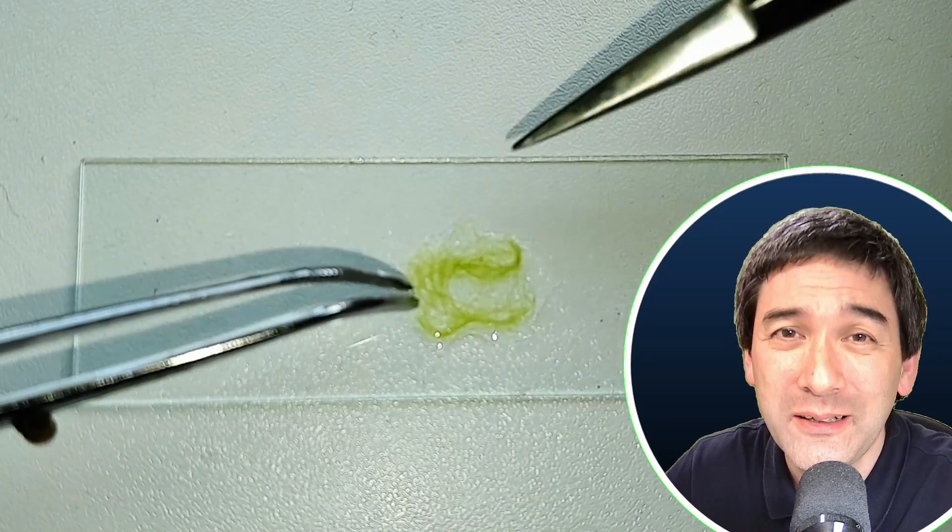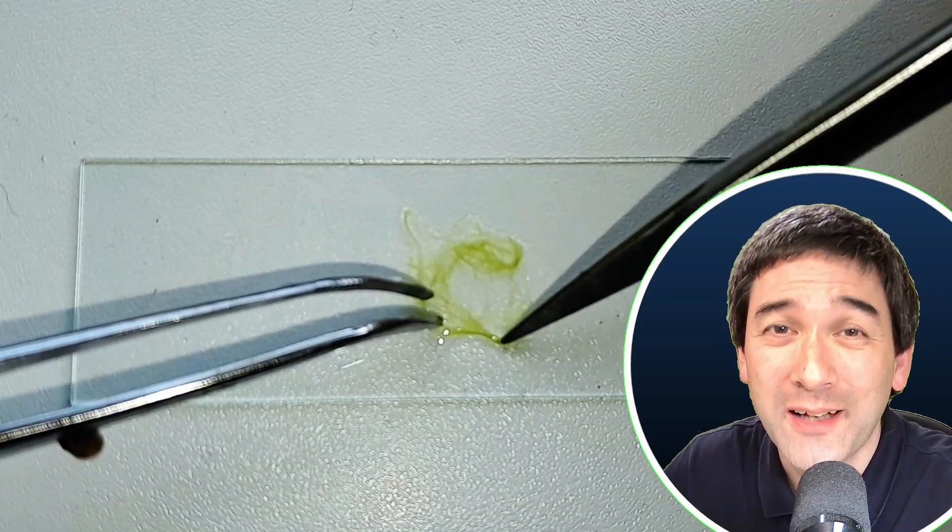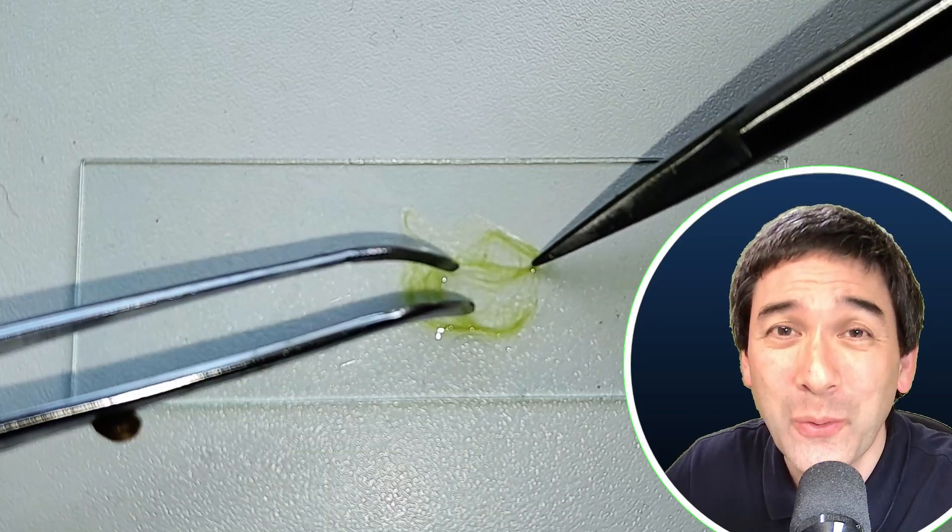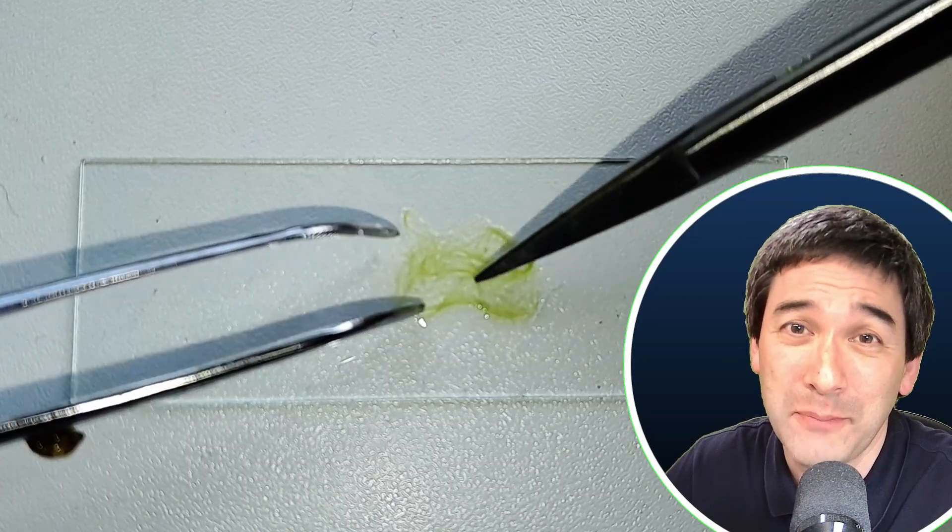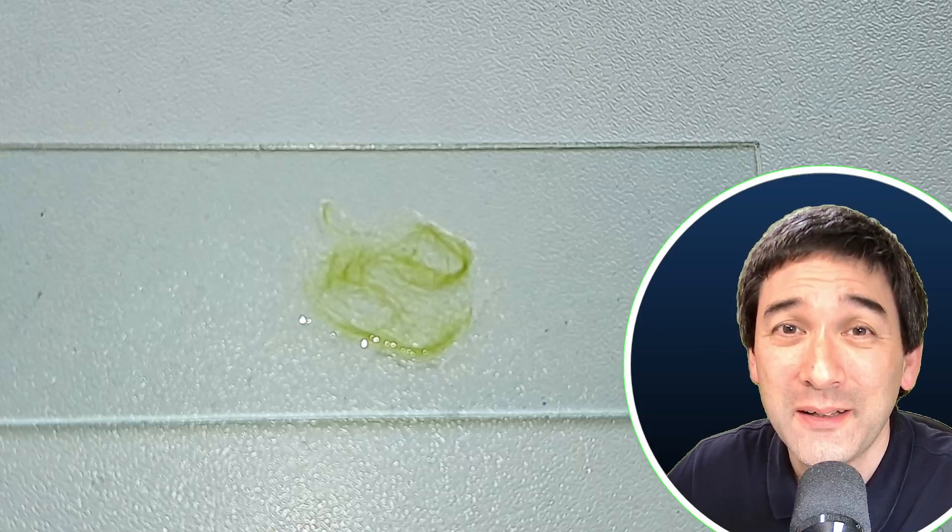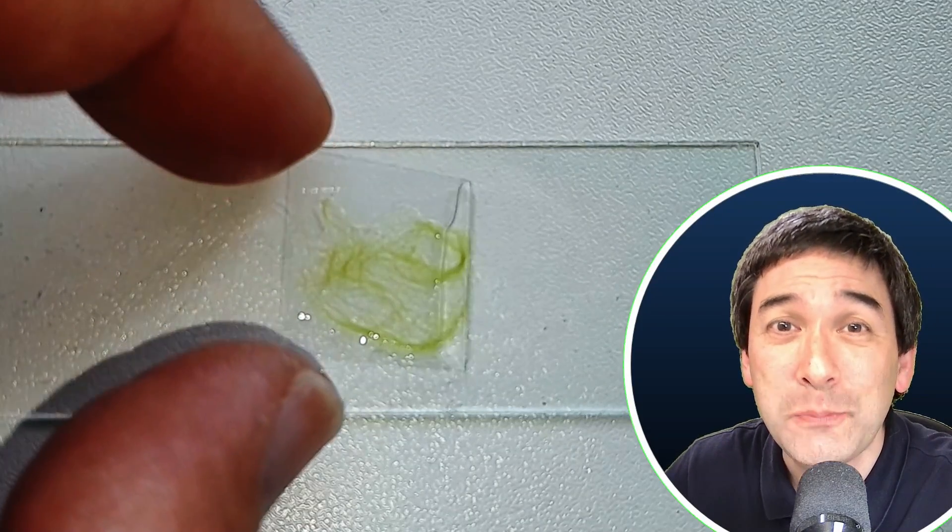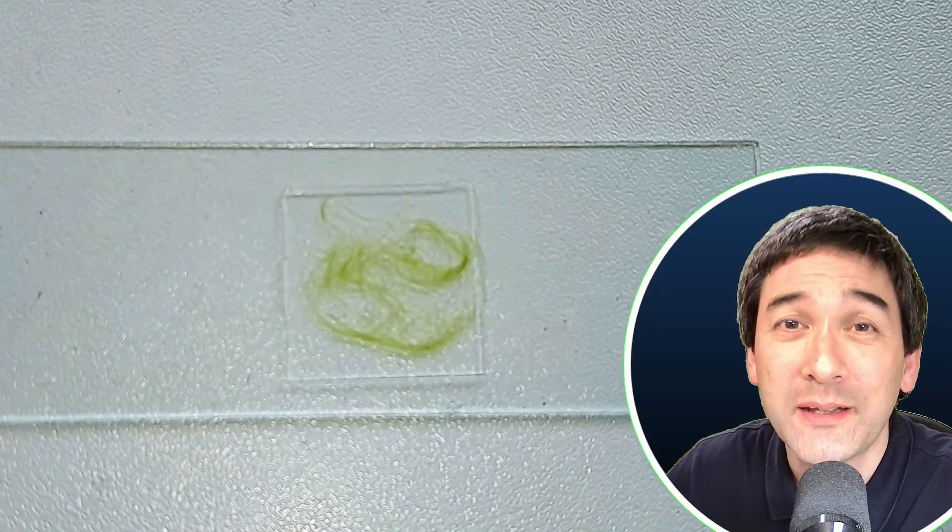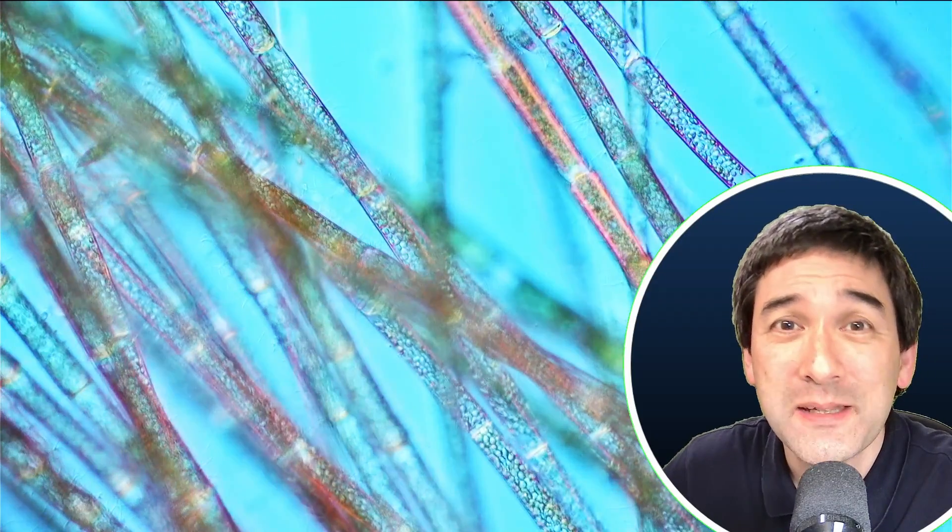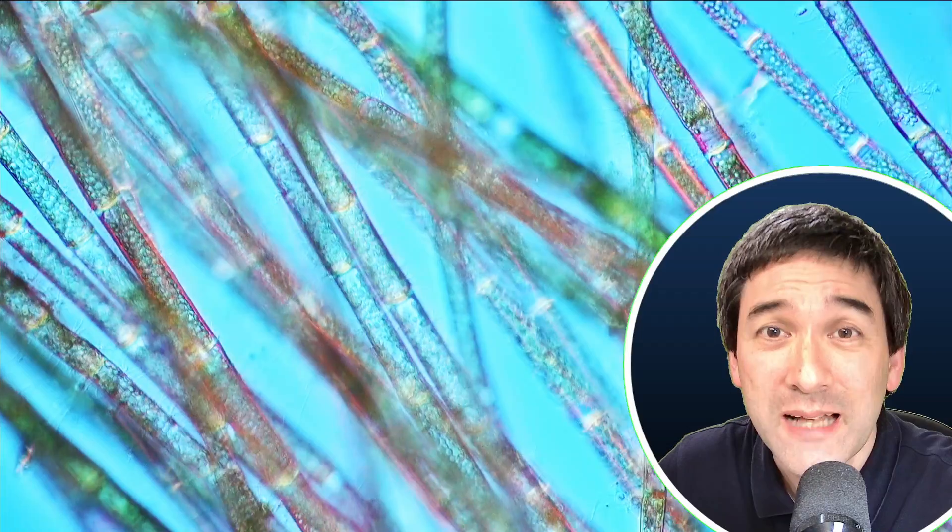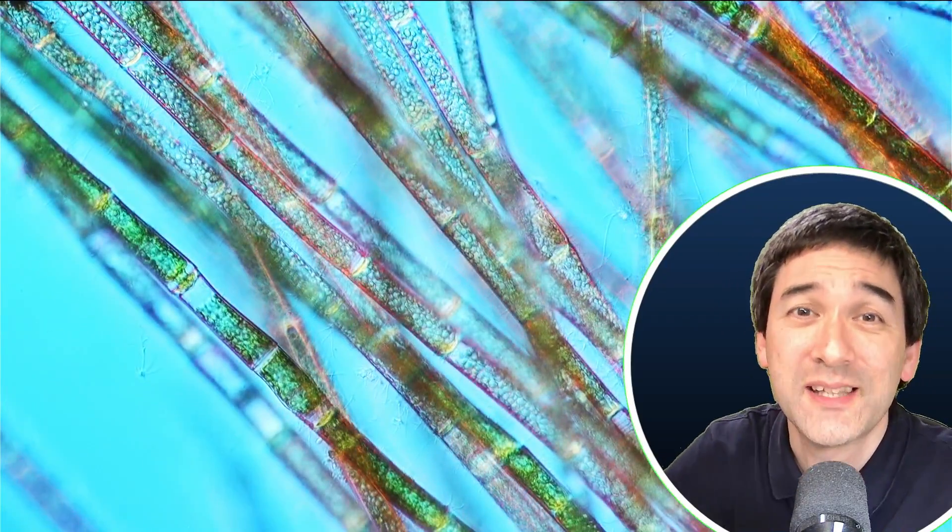I do have a little mini aquarium in a jar and there are some algae growing in this mini aquarium. I simply put it under the microscope and I wanted to find out whether ChatGPT actually is able to identify the type of algae that I have here. So this is basically a picture here. Of course, it's filamentous algae, not surprisingly. Chloroplasts, these are the green structures inside the cells, long string-like cells.